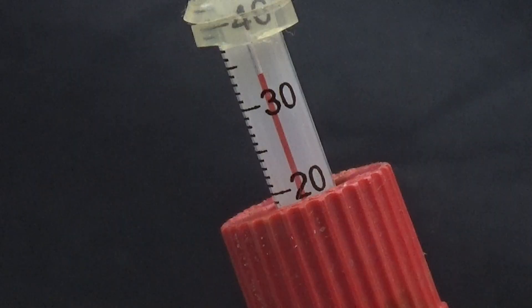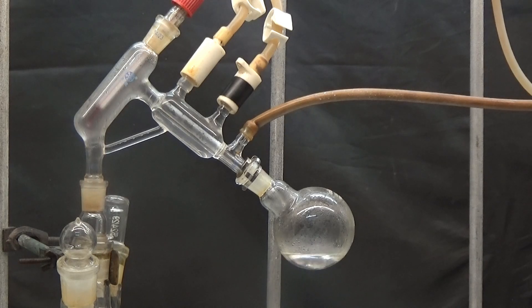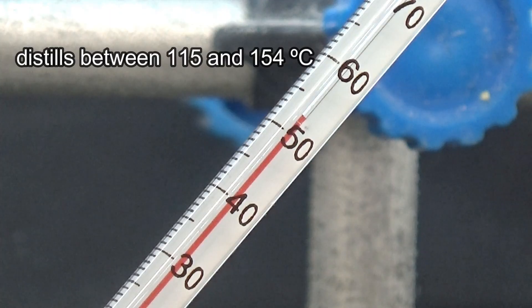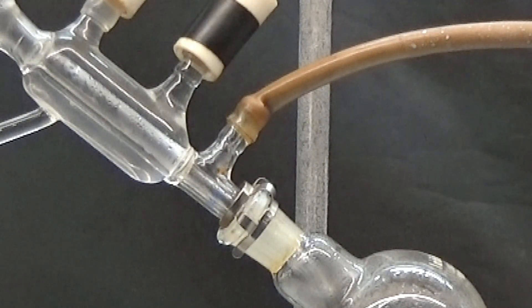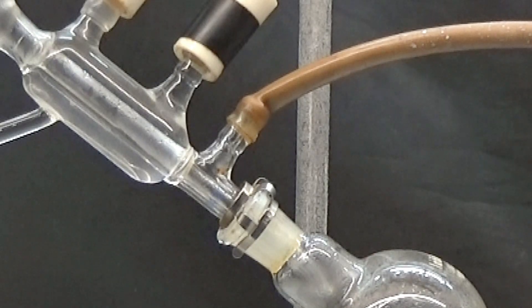Let it cool down. Distill the product obtained in a 100 milliliters flask, collecting the portion that distills between 115 and 154 degrees. Eliminate any hydrogen bromide vapors by connecting the distillation equipment's outlet to the fume hood.